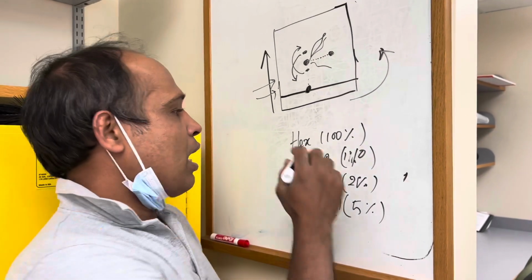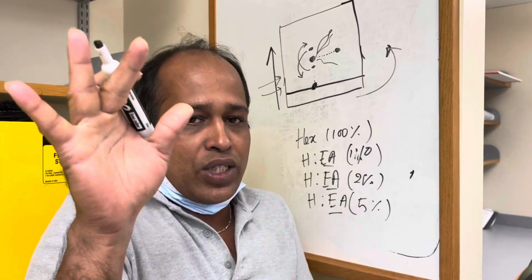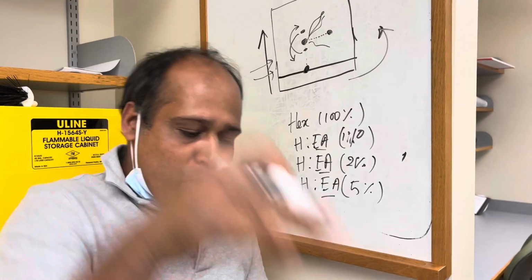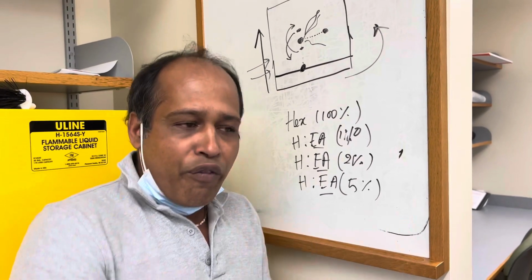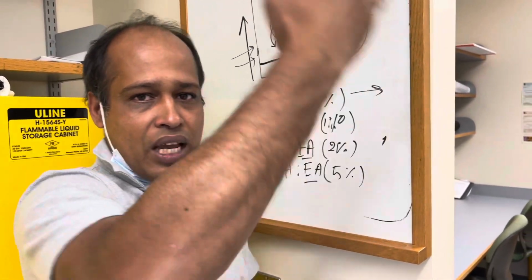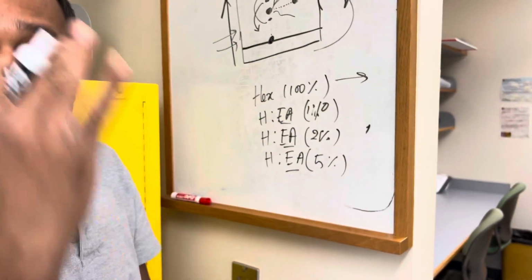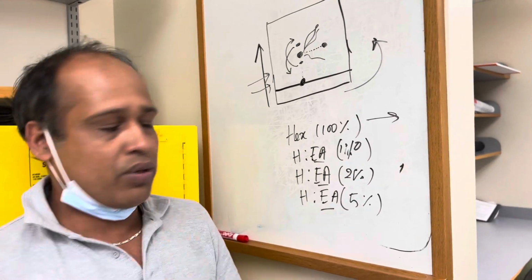Sometimes with hexane you may see it is not moving actually, but you have to take it out, dry the solvent, and put it back again in the same TLC. So run it 3-4 times in hexane and see what changes, whether you see anything moving or not. Even if something is just moving, that means it has some tendency to move with hexane. Then you can start with hexane.